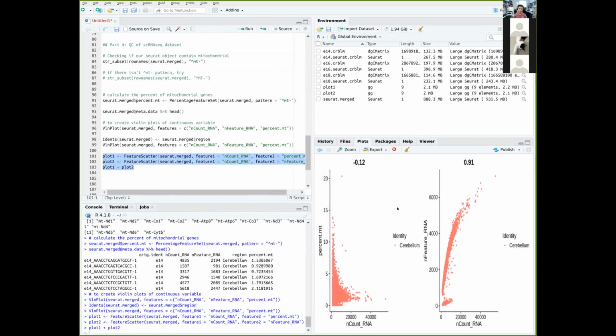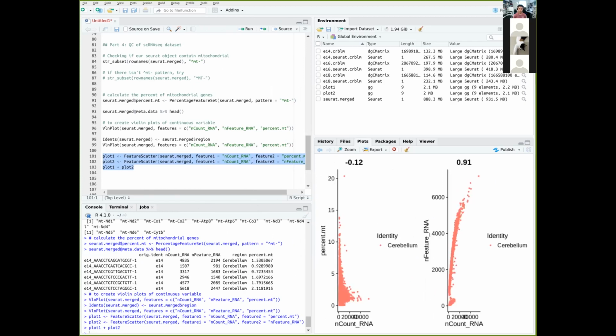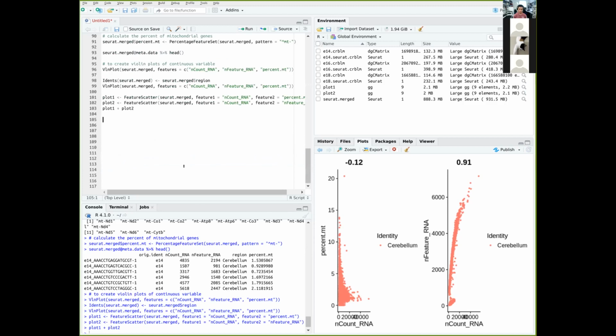So I'm gonna quickly just plot out a line in plot 2. I'm gonna copy this set of code, but follow along with me and just run the second code. Okay, I'm going to paste it into my RStudio. So just print out a second code, plot 2 plus geom h line. So basically, I'm just trying to say that run this.